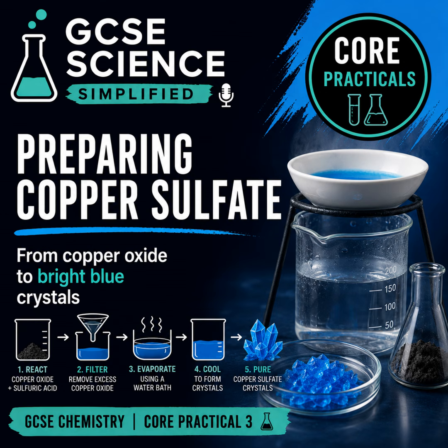Part 3. Now we've got excess copper oxide in our copper sulfate solution. So what do we do? We use filter paper, a filter funnel, and filtration. The solid copper oxide is the residue. The liquid or solution of copper sulfate is the filtrate. Now, this step is crucial. It ensures the solution now only contains our copper sulfate salt and water.